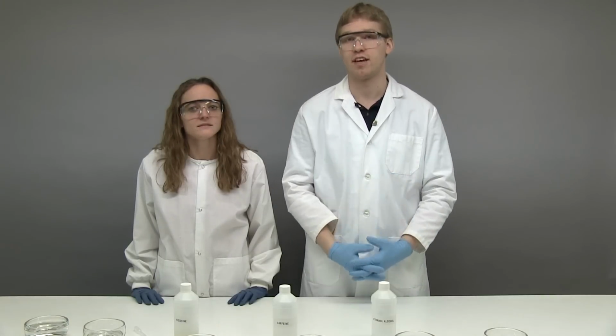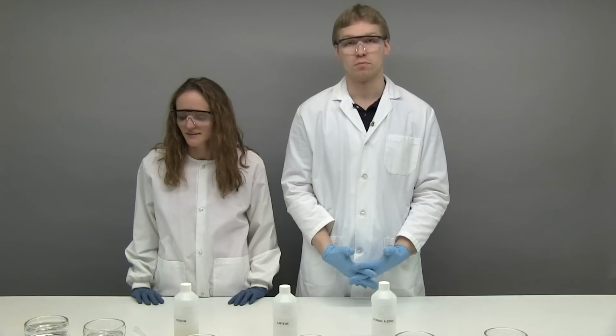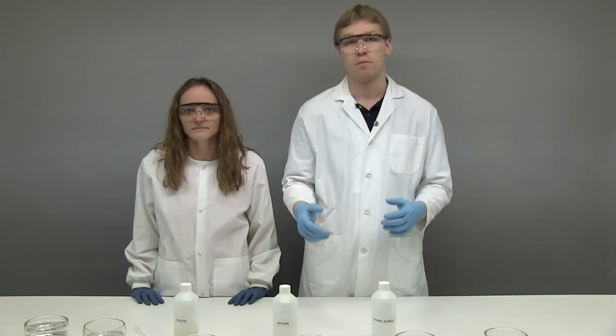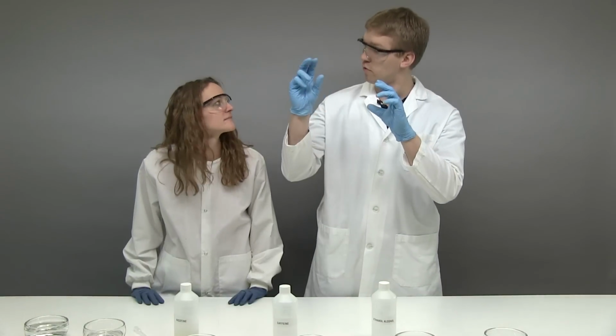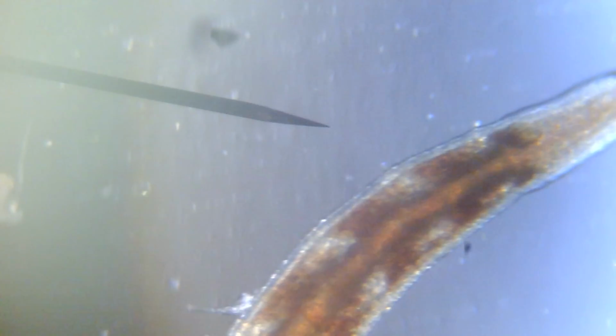To further your investigation, you can determine what effect these toxicants have on the blackworms with their blood flow. The blood flow in a blackworm actually travels from the tail down to the head. In this video clip, we used a compound microscope to visually show the blood flowing in the middle of the body. After exposing blackworms to toxins, you can then transfer them to the microscope to have your students observe what effect it has.